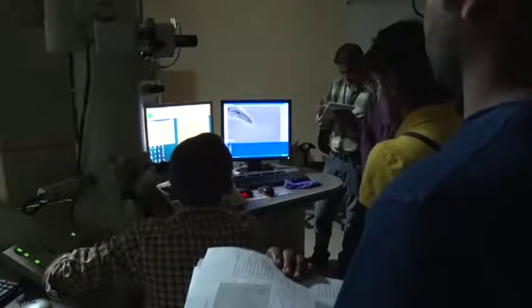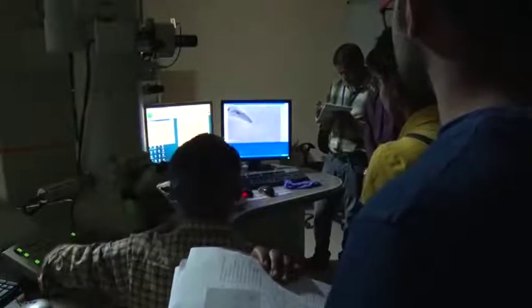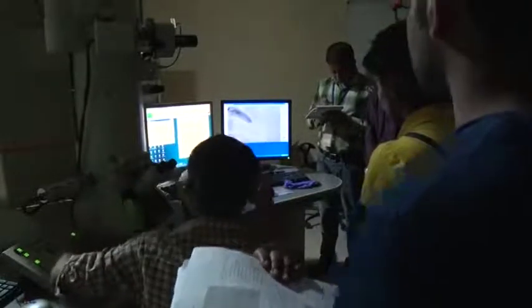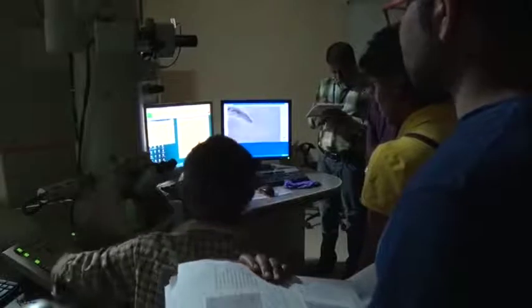So now you see there is more movement. It has become worse. Yeah? The movement has become even worse. So right now the optic axis of my objective lens is not aligned to that of the microscope. So now we will correct this effect. Keep looking there so that we get minimum movement. That's the aim.